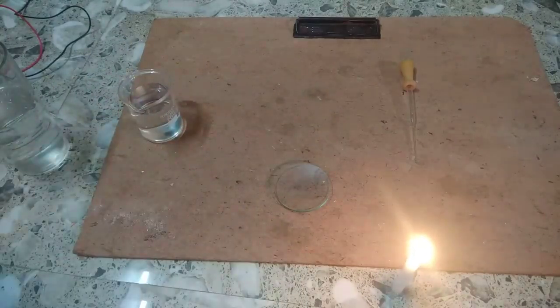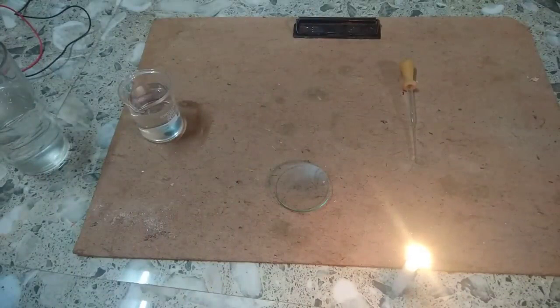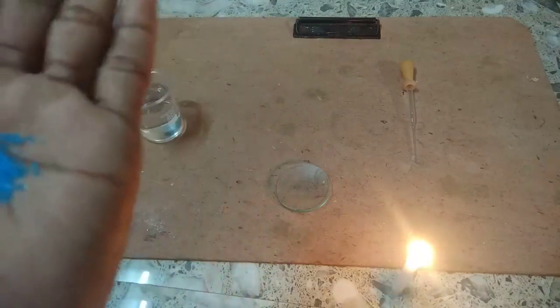Take some copper sulfate in the test tube.